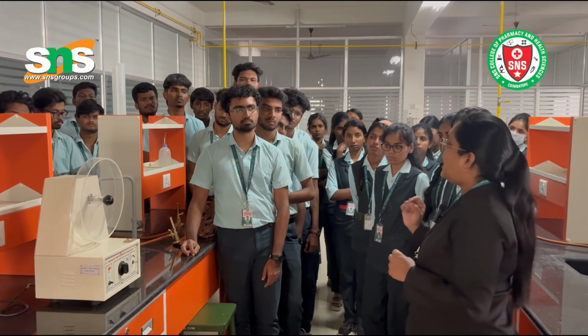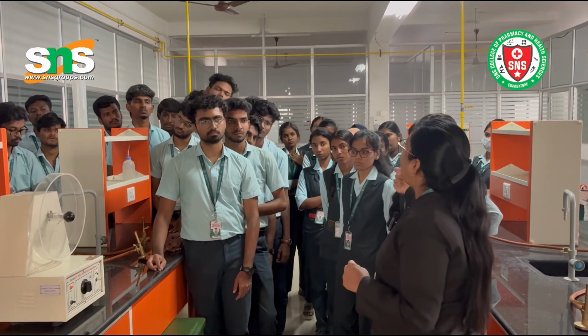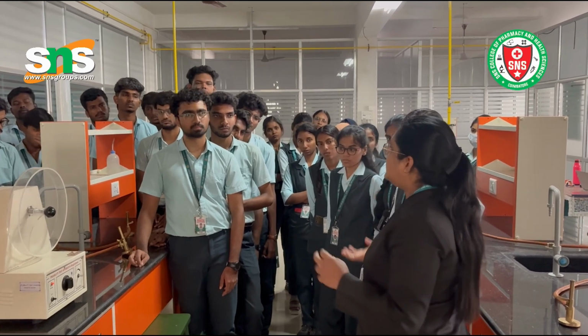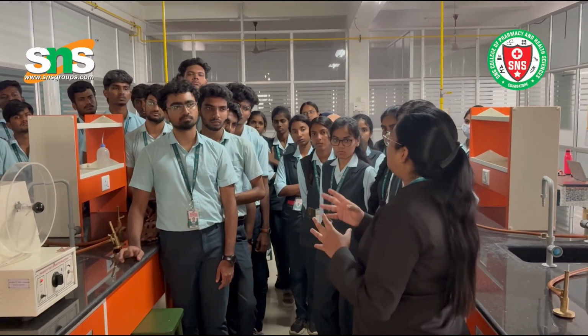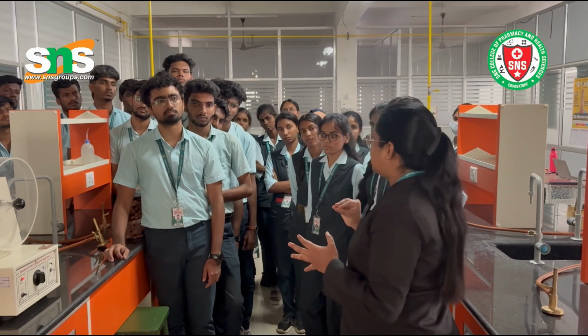After 100 RPMs, we'll take the tablets out and go for the final weight. Now we have a formula: initial weight minus final weight, and you calculate the friability percentage. The final friability percentage must be less.